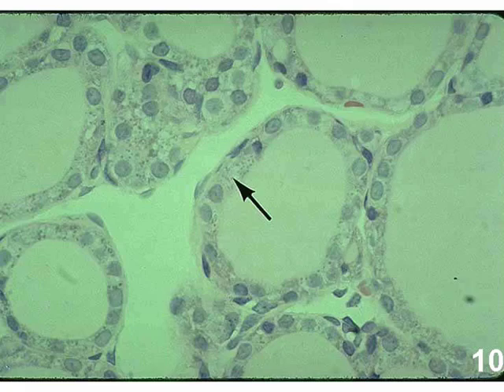At higher magnification, the thyroid gland has the appearance of what we call follicles. And follicles are roughly sphere-shaped and cut in cross-section. You can see a cuboidal epithelium that surrounds a lumen, and within that lumen is a substance which is the precursor of T3 and T4.